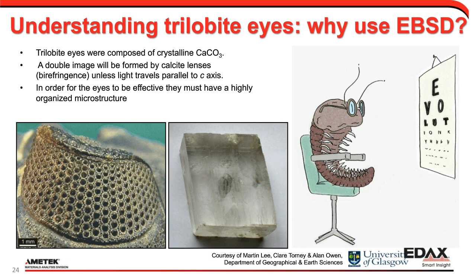What we see is when we look at a crystal, when the crystal is highly ordered, meaning that all of the grains are in the same direction, it appears clear to us. Now, if you have a crystal or material that's hazy or fuzzy, that's usually because they have many different orientations, and that type of arrangement would not be a great eye, right? We want our lenses to be clear, and in order to be composed of the calcium carbonate and be clear, they need to have the same orientation for the organism to be able to use them effectively to gather light and interpret their surroundings.